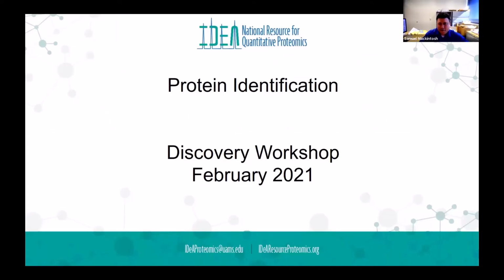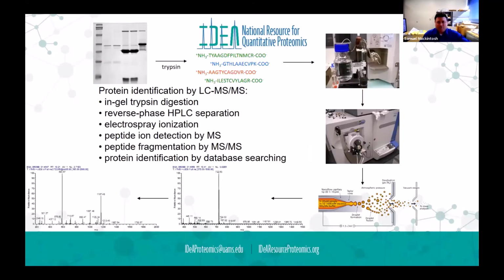So this will take us back to a little bit more technical information. We've sort of set the stage for this with the last couple of talks, but we always find it useful to give everybody at least an introduction to how, specifically, we use mass spectrometers and mass spec data to identify peptides and proteins. So this is where we start out.